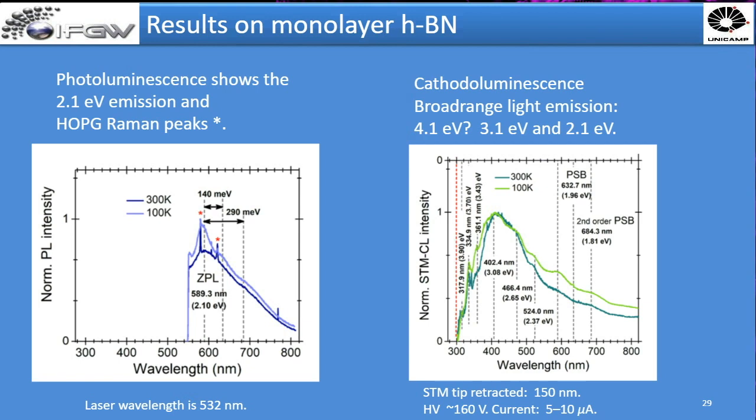If we correct this photon count rate to the amount of photons that were emitted by the sample, we get the quantum efficiency of this gold surface, and we could get the same number as in the literature.